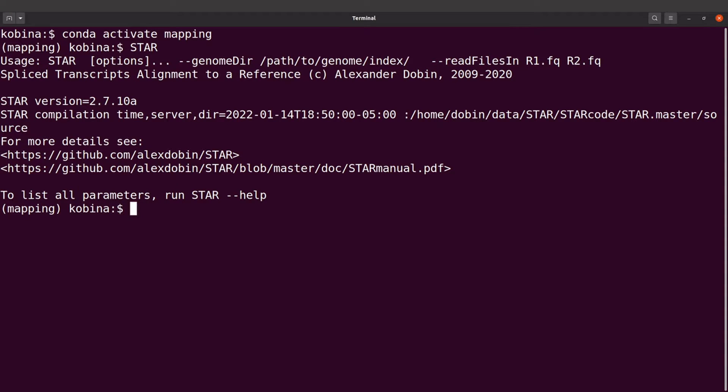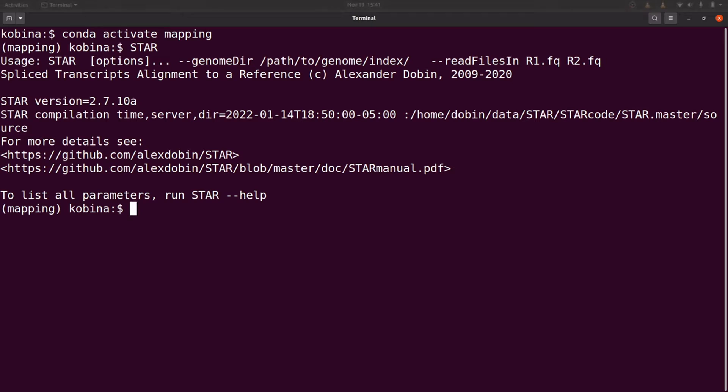So we have successfully installed STAR using conda. Now that you are done with this exercise, I also encourage you to check the video which shows how to map RNA sequence to a reference sequence using STAR.